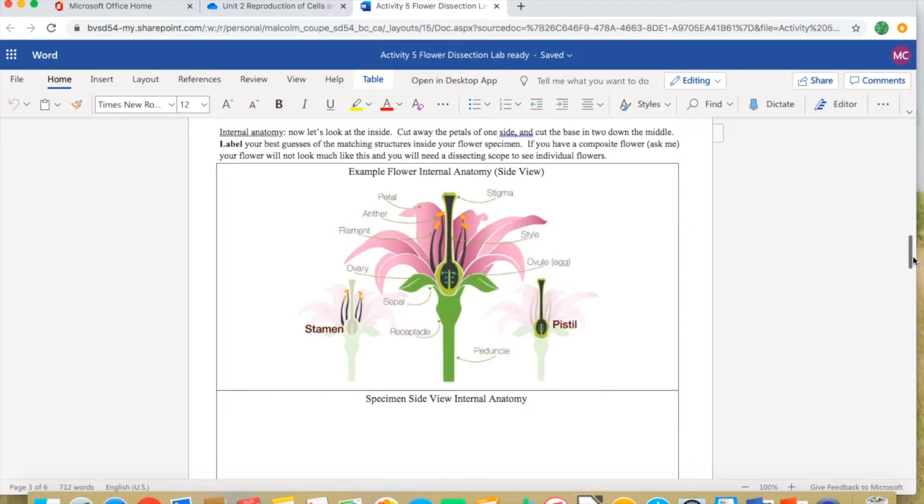In general, for a flowering plant, the female parts are going to be in the middle. The male parts are immediately next to it on the side, and around the edge of the flower there are structures to attract pollinators, that is to say, petals. These are the things that give flowers their special colors. Here we see a diagram, not necessarily of what every flower looks like, but showing the different parts you can expect to find in a flower.